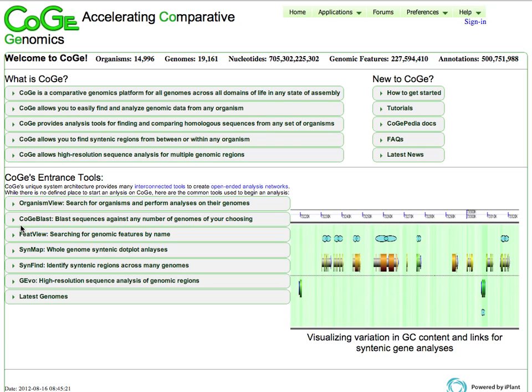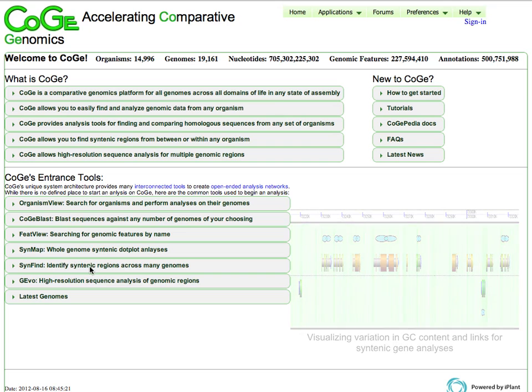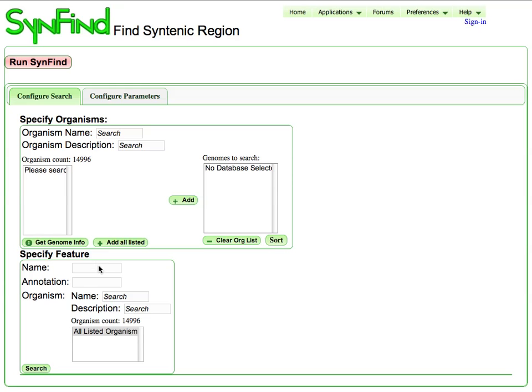So there's not necessarily a direct way to do that per se, but there is a tool in CoGe called SynFind, which will identify syntenic regions across any number of genomes inside of CoGe. The way that it works is you need to specify a genomic feature in one genome.